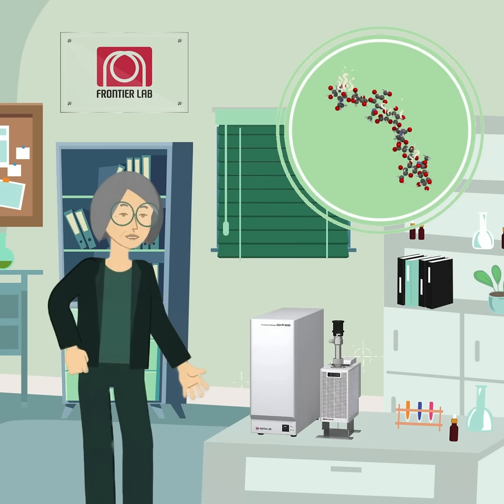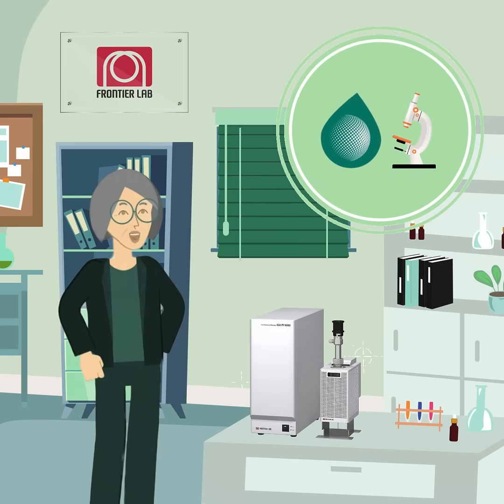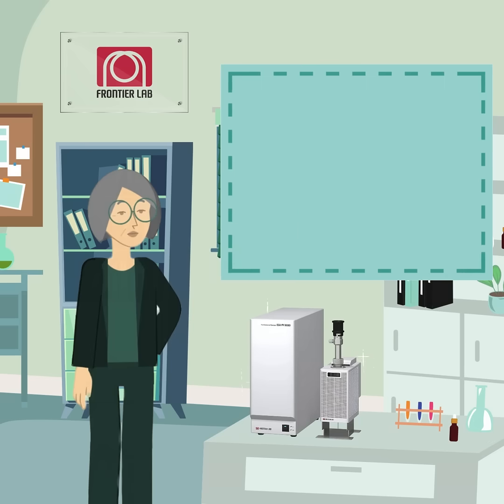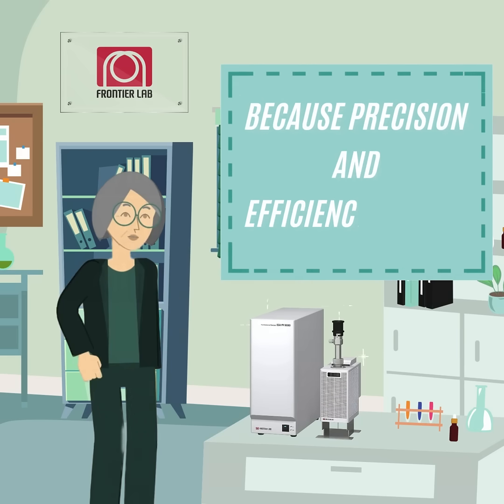This method is perfect for distinguishing volatile additives from the polymer matrix, and is widely used in material studies to identify both additives and decomposition products. With double shot, you get faster results, accurate quantification of components, and reduced sample usage — saving costs. Double shot: because precision and efficiency matter.